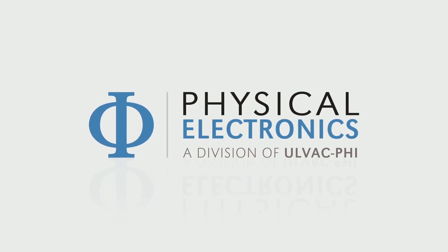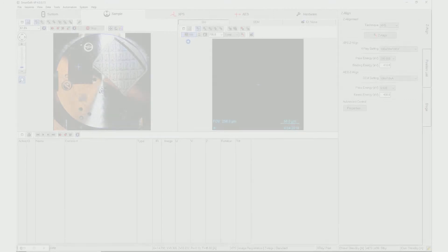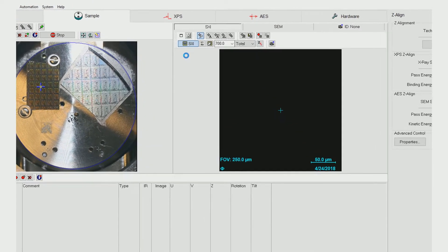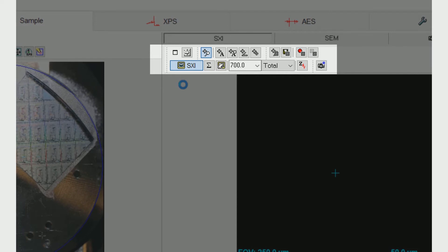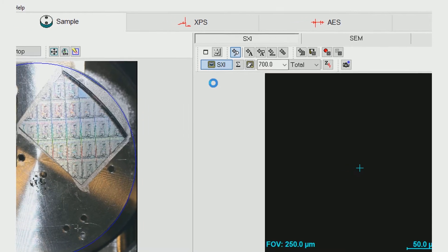Physical Electronics is excited to introduce a new XPS software feature called Image Registration. This optional SmartSoft add-on, which was previously only available for Auger Spectroscopy, greatly enhances small area XPS analysis. Image Registration is coupled with PHI's unique SXI X-ray imaging capability to ensure XPS analysis is performed at the precise location of interest, even for very small features.